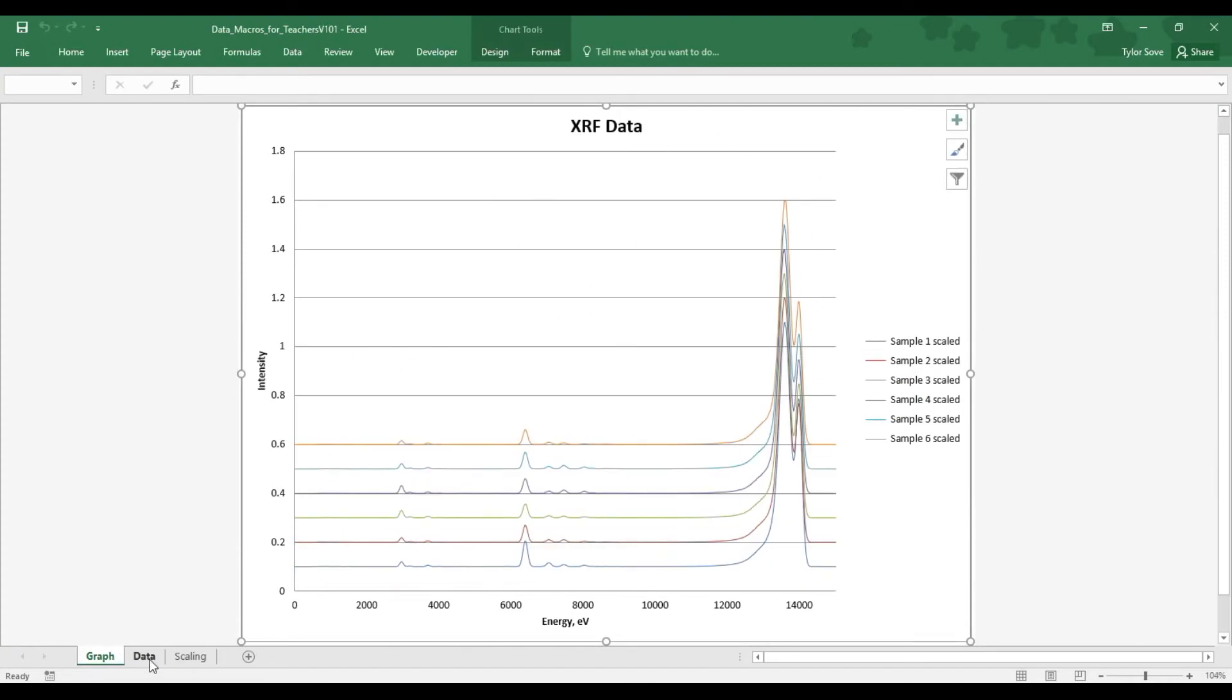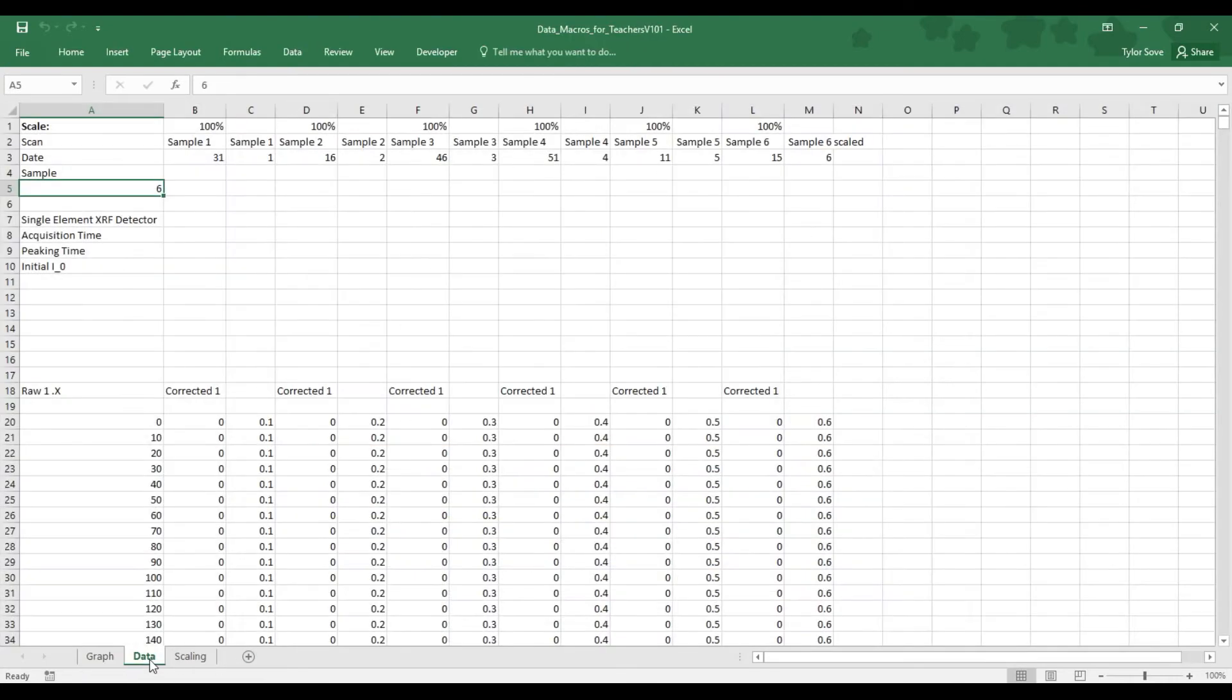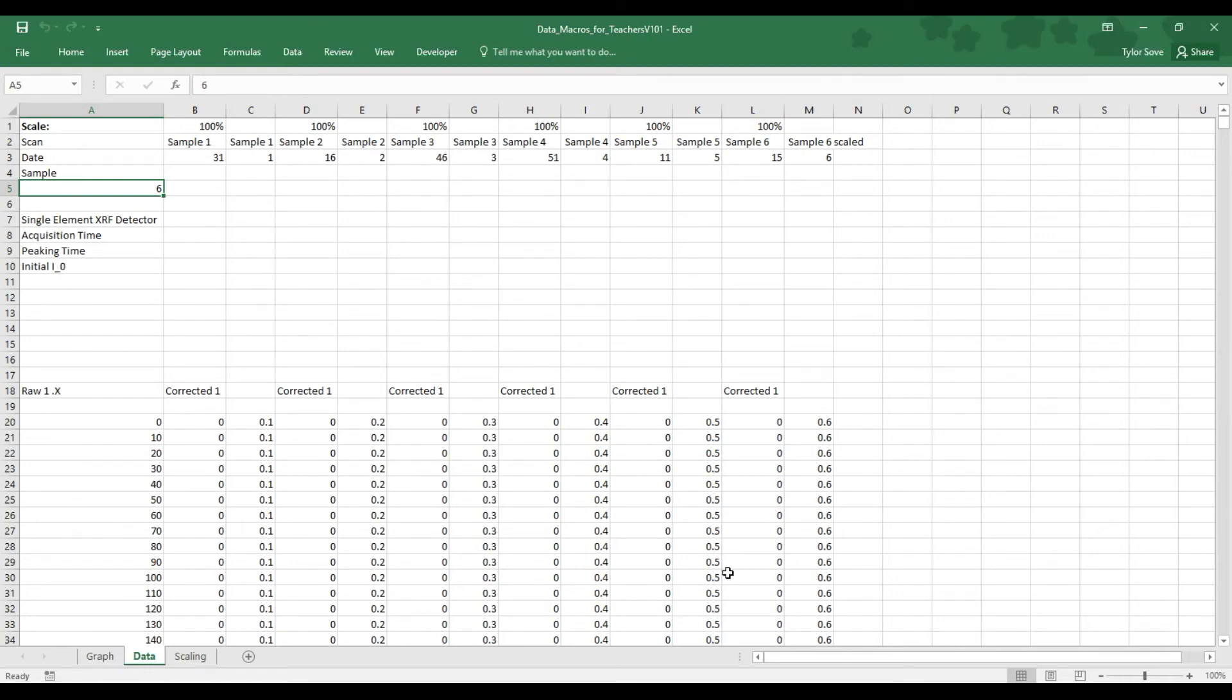So, if we go over to the Data tab, we can see that we have our sample names right up here. We have some generic information about the samples, generic information about our detector, and then down over here is our sample data.